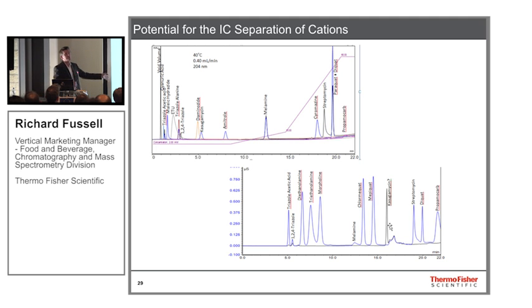So they're nearly always done by doing a derivatization. Actually an ion pair, I should say, rather than derivatization. But we know that these compounds are being used. There is evidence that kasugamycin is used in the field, and so is streptomycin. But how many laboratories are actually analyzing those compounds in the samples which you analyze? So this is something that we are trying to develop.